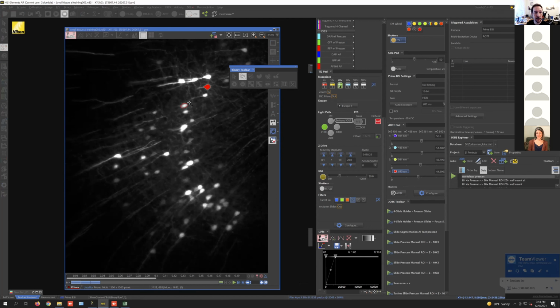But you can see just doing this is quite a quick process. And I would just go through and find all the cells. And this is going to be, again, like there will be some personal subjectivity on what you consider a cell. But this is something, if you were manually doing it, that could fluctuate day to day. Like today I might say that that's a cell, but tomorrow when I'm counting I might be feeling a bit different, or the screen might look a little bit different and I might not count it.